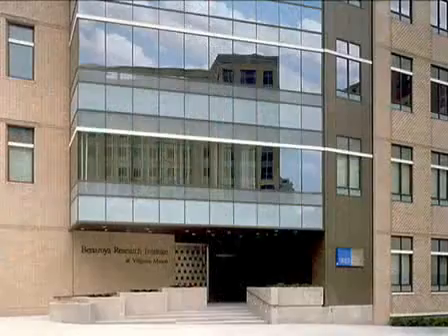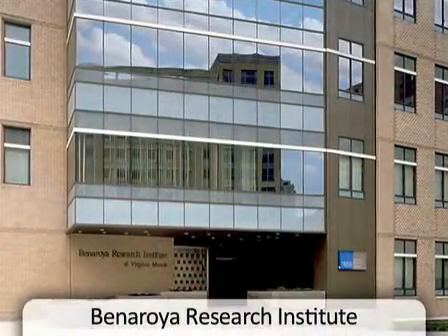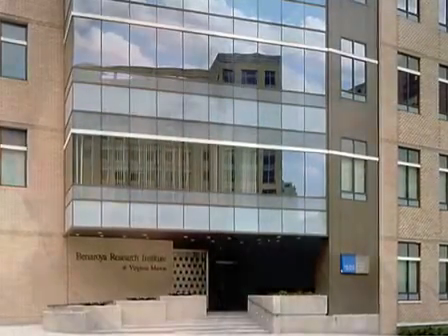And the tetramers that you use are actually made here at BRI, is that correct? Yes, we're one of a very small number of labs in the country that have successfully made Class II tetramers. Our intent is to distribute these reagents at cost to any laboratories that are interested in importing this technology.